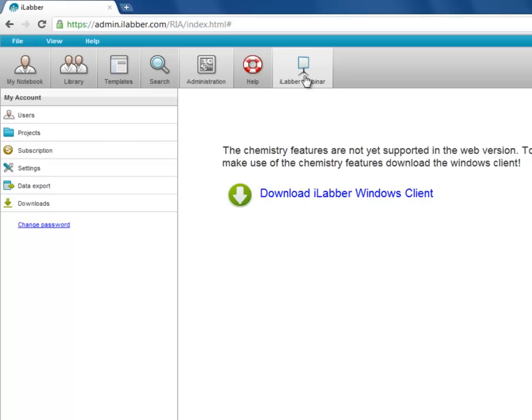So that's a quick overview of how you can find your way through the different tabs in iLabr. Thank you.